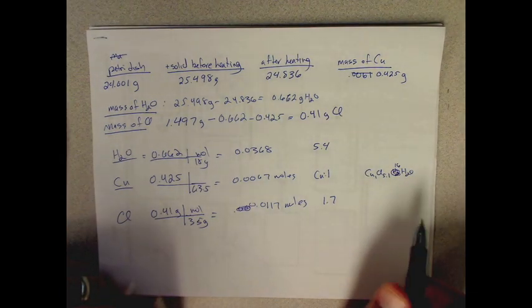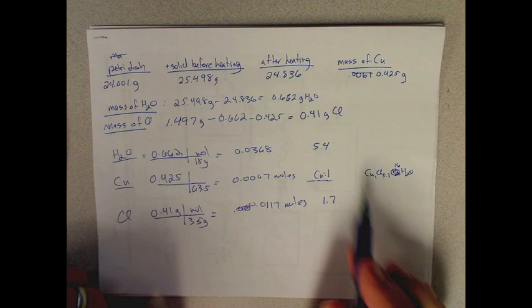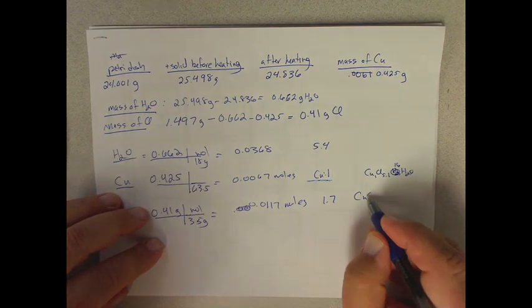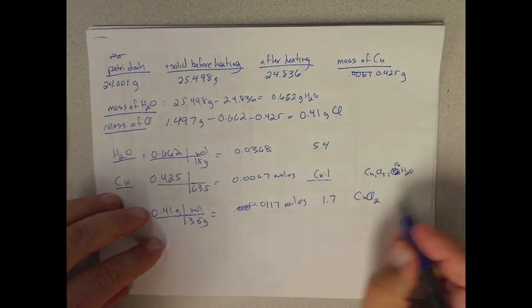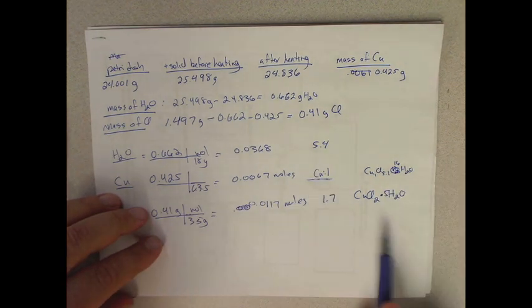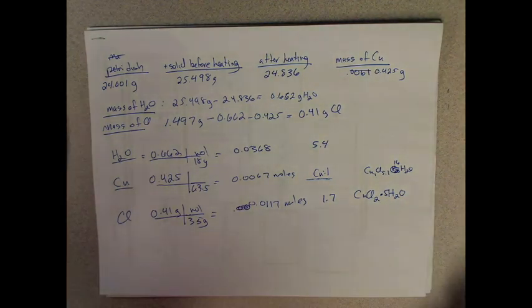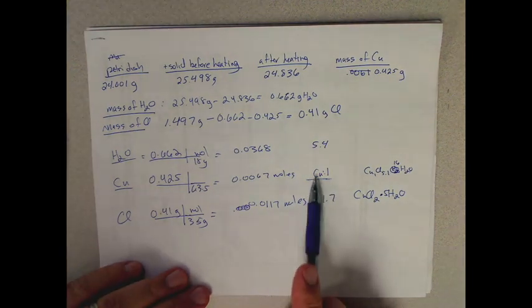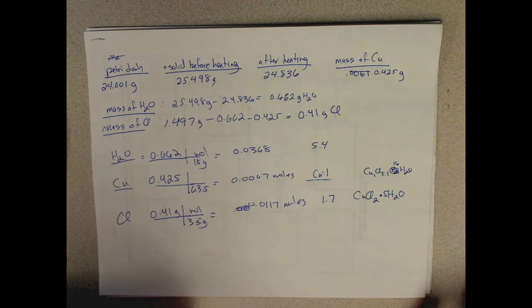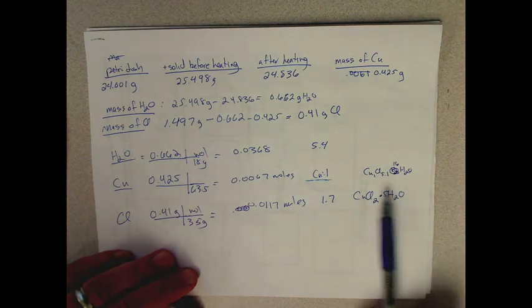So you kind of have to go with what we know about copper in this case and what oxidation states it likes, and you can round a little bit. So I'd say it's probably more likely, at least the ratio of copper we can round up, and I would probably round down here. This is a little bit right in the middle, but according to this, it's probably closer to CuCl2 5H2O. That seems to be a reasonable number. And then, depending on the post lab, they may actually say, okay, if you know the oxidation states, what's most reasonable? Now, water of hydration can vary between compounds. There's no preferred number there. But anyway, you may have to do a little rounding in this case.